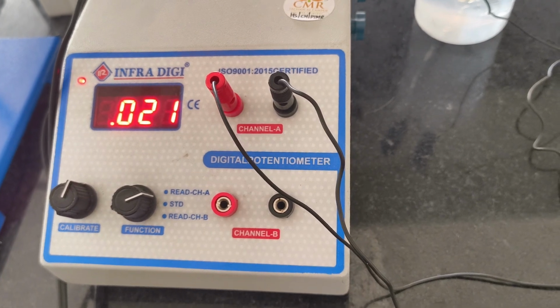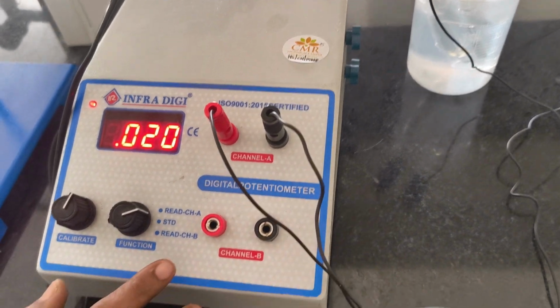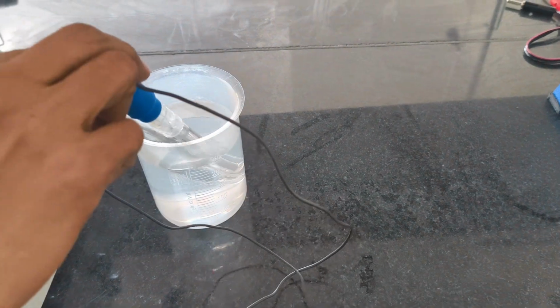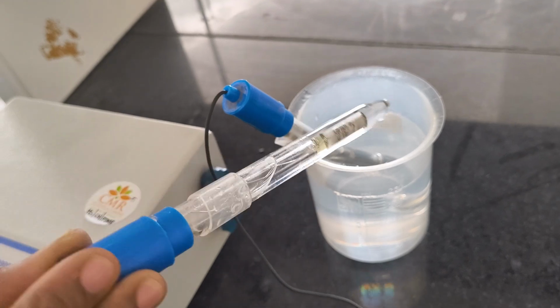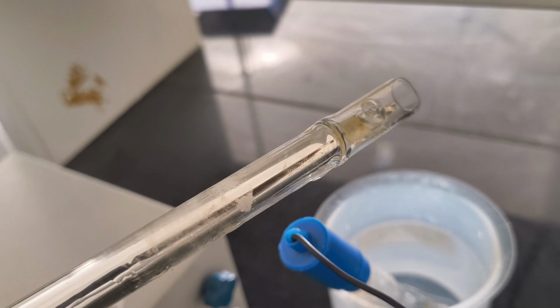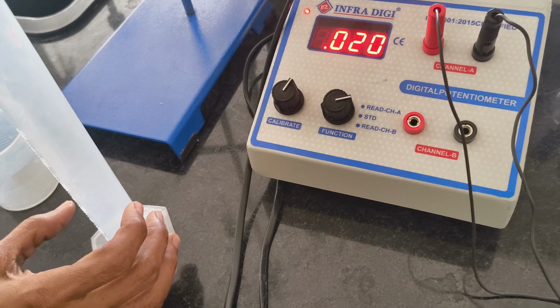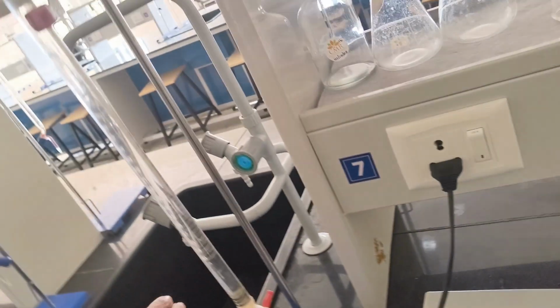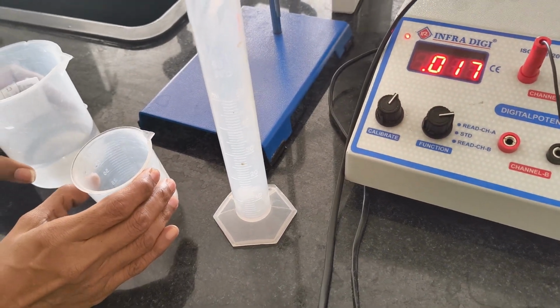Estimation of HCl by potentiometric method, that is the experiment. The requirements for the experiment are a digital potentiometer, one calomel electrode, and one platinum electrode. This is a calomel electrode and this is the standard platinum electrode. These two electrodes are used, and the apparatus required are a measuring cylinder, burette stand, burette and two beakers.